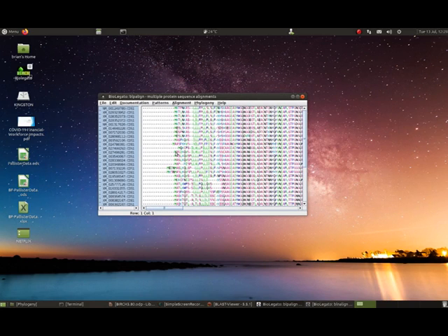So one of the first problems we encounter, of course, is the heterogeneity of the amino-terminal ends of proteins, which is very common among proteins. And so we would probably need a way of editing out these very gappy regions, because if you think about it, a gap represents probably a single insertion deletion event, but when you have multiple gap characters, that implies each gap character is an independent mutational event, and that's not realistic for the way protein and DNA sequence evolution works.